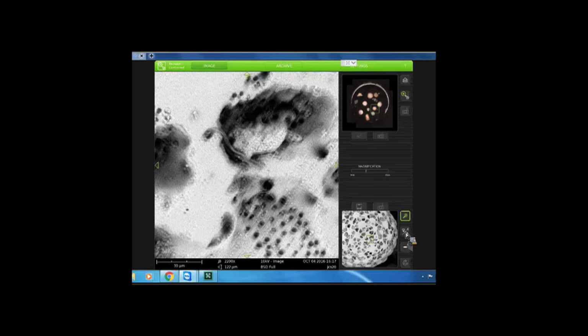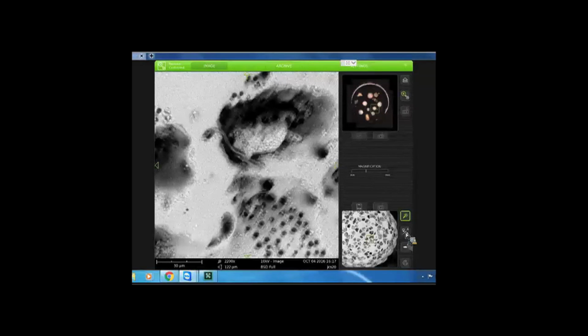You may not have it active today, but I was using one of these SEMs one time, and they had a measuring tool on it. Is that an option? We don't have to do it today. I don't think we'll have time. Yes, we do have a measuring option. You would save the image, and then you would bring up a ruler, and you could actually pick 2 points, and it'll measure from each of the points.